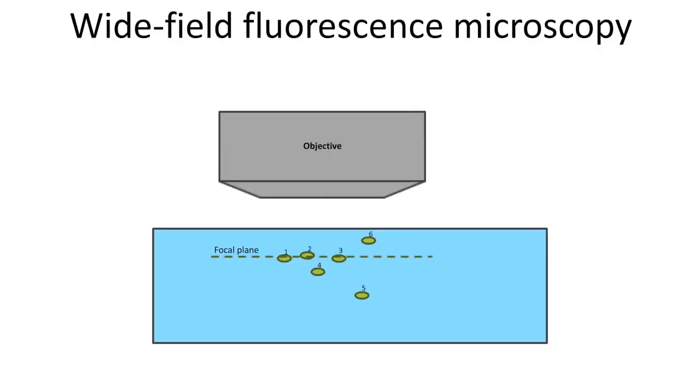So how do you think about these types of fluorescent microscopes? In essence, you can think about the epifluorescent microscopes that you may have in your lab, where you use them to look at fixed tissue, for example, fluorescent fixed tissue. In essence, these miniaturized microscopes are exactly that. So you shine light over the sample at a particular wavelength, and fluorescence comes back, and you can record this emitted light.